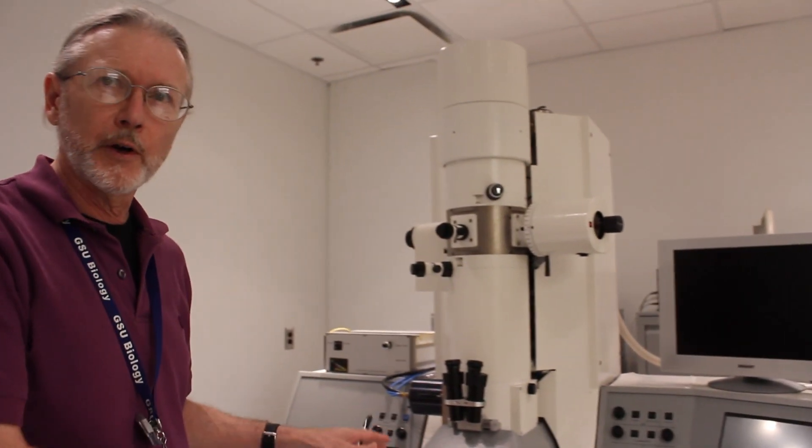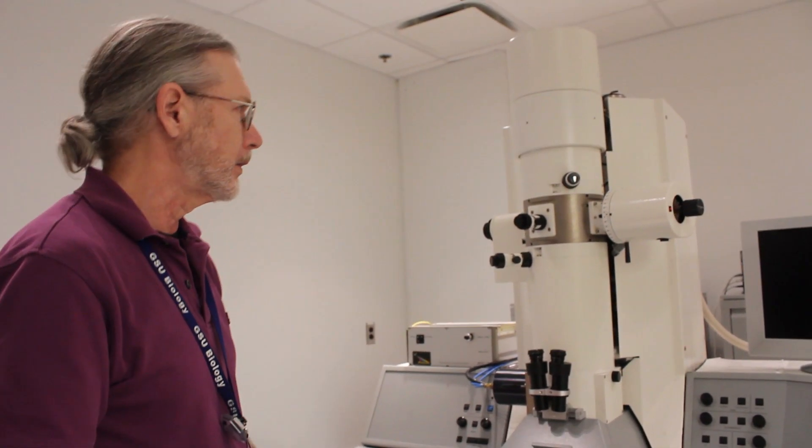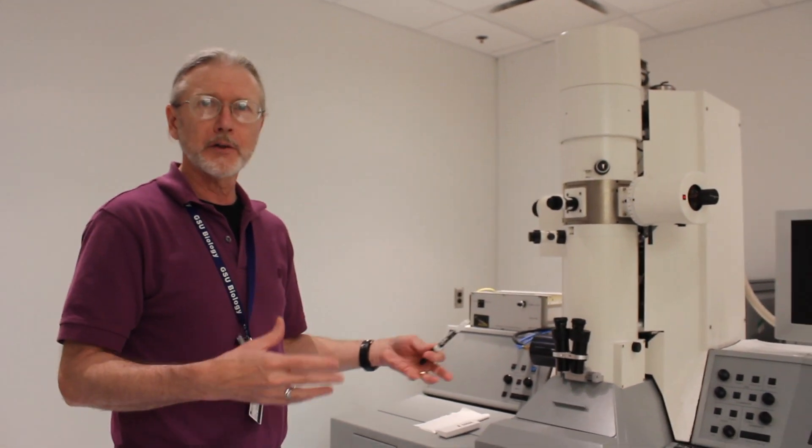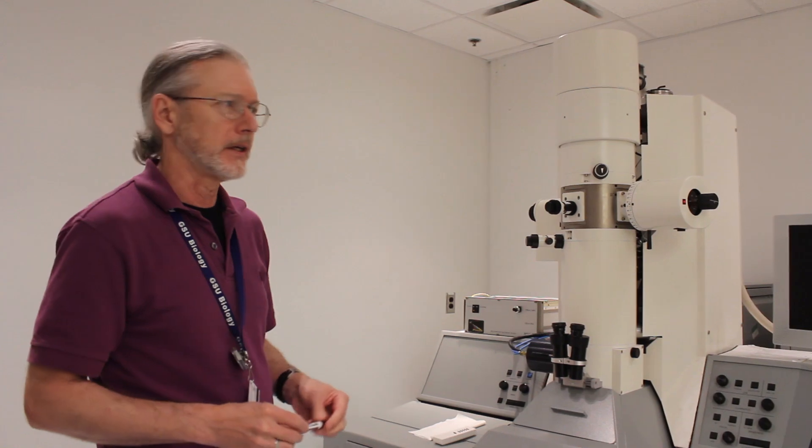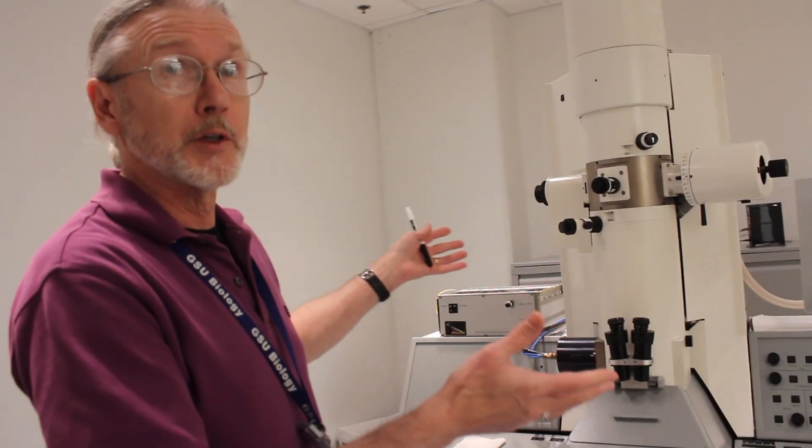This is a transmission electron microscope. It's not running right now, which is why it's very quiet. Because it runs on high vacuum systems and there's a water chiller and the whole nine yards.